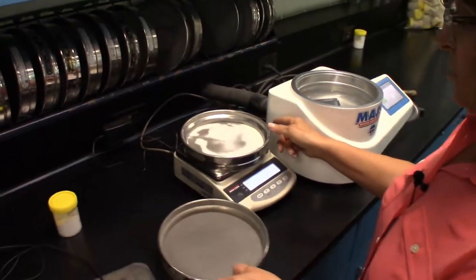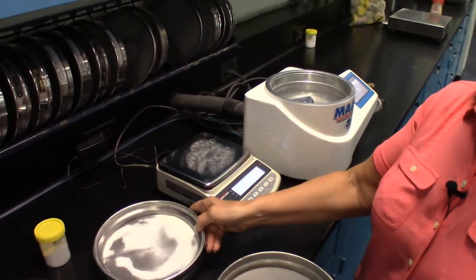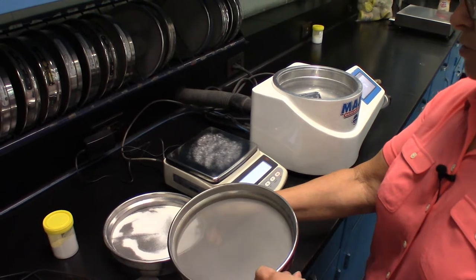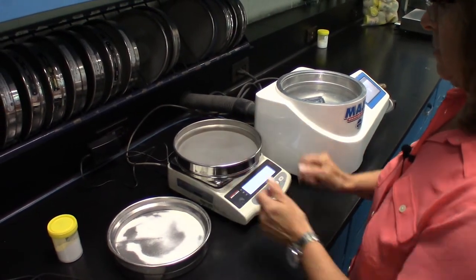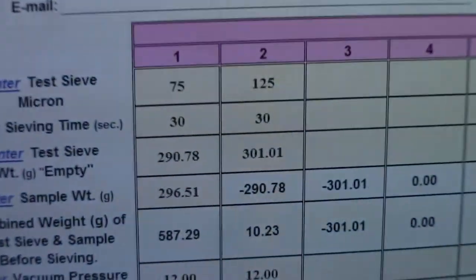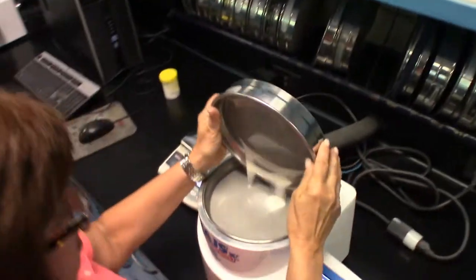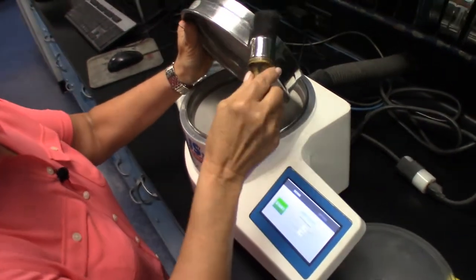Now I'm going to weigh my second screen, which is the 120 mesh screen, and place that on the scale. Now I'm going to put that screen on the JetSiv and transfer the material from the first screen to the second screen.